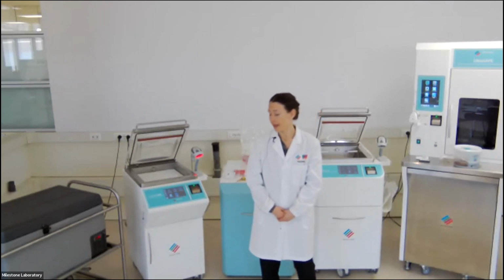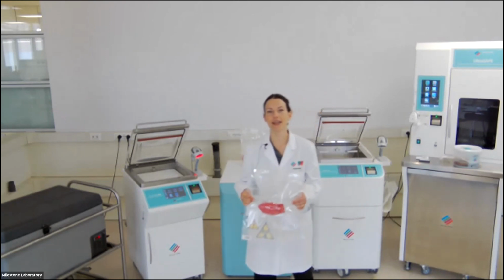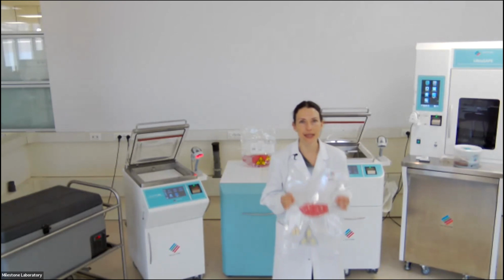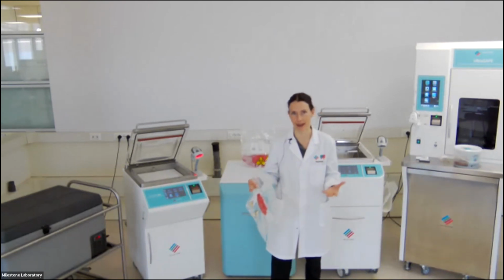Okay, another question is this one. What about bag storage versus container storage in wet archive cabinets? What about space and ease of storage? The use of bags takes a really big advantage for people of pathology lab regarding the archive.